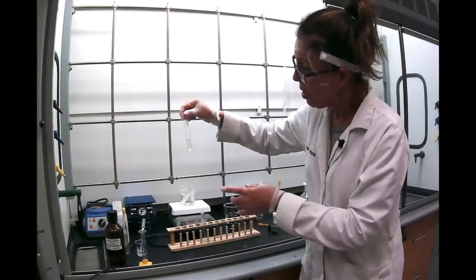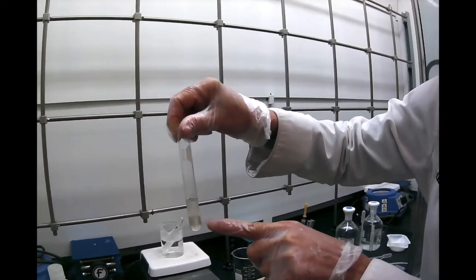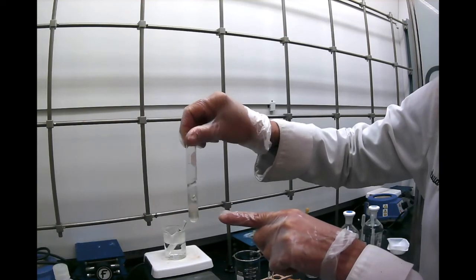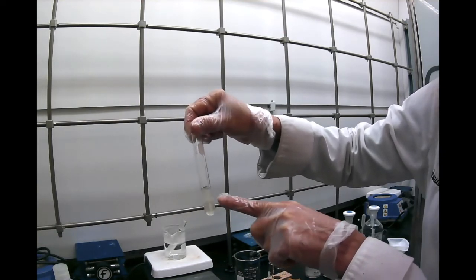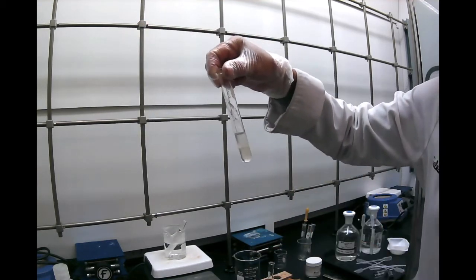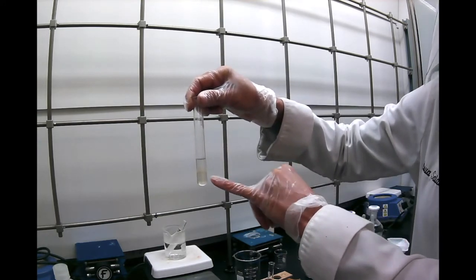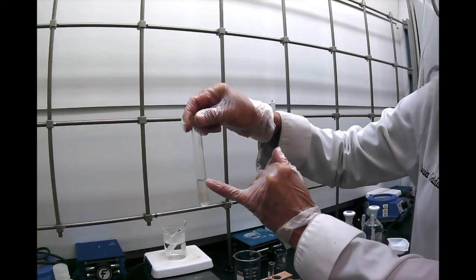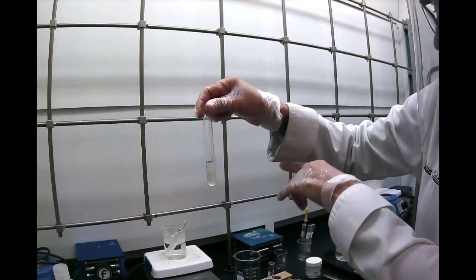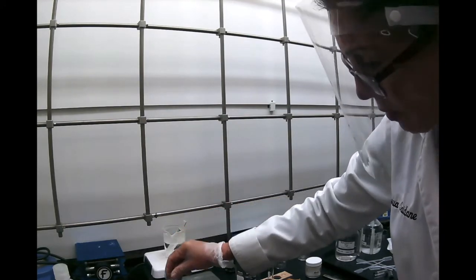Here. And again, methylene chloride is at the bottom. And you see here sometimes when you have these chemically active reactions and the solution is concentrated, it has the tendency to be a little more cloudy. So what I want to do, just like I did earlier, is remove the aqueous layer, put it in a test tube, and leave the organic layer to dry to see how much benzoic acid is left over there. So how do we do this?